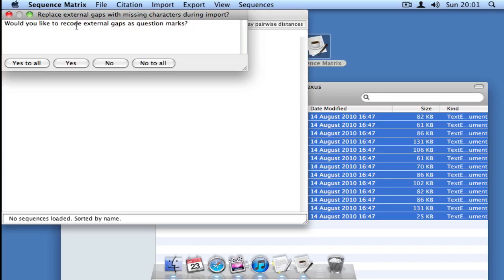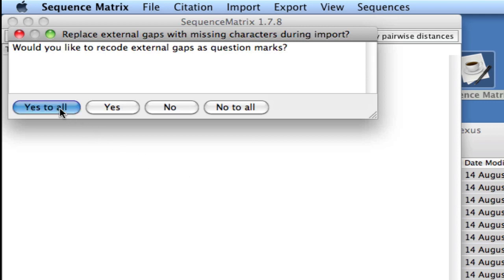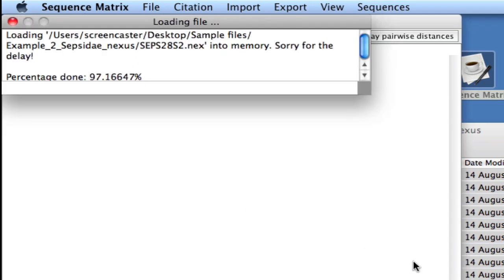Next, Sequence Matrix asks you if you want to recode those leading and trailing gaps, which I pointed out before, as question marks. You will usually want to select the Yes to All button.